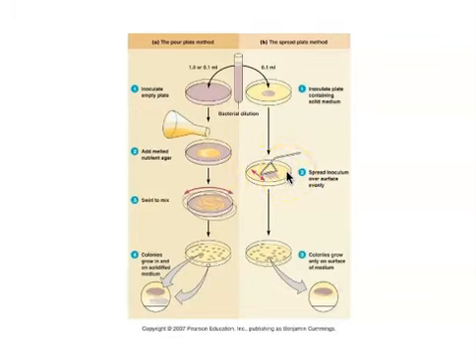The key thing, again, is to spread the cells in the sample all over the surface of that plate so that every inch of the plate is covered. The plate goes into the incubator for about 24 hours, and then we evaluate it. You can see in the drawing that we have individual colonies growing all over the plate. Those colonies will be counted, and then we'll use that count to mathematically determine an estimate of how many cells were in the original sample.